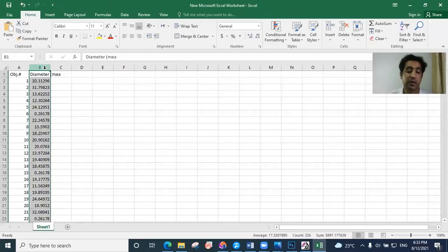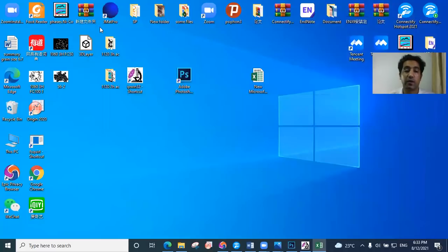So I want to make a histogram of this. So just click here and copy the data and open Origin. Just wait until the app is open.